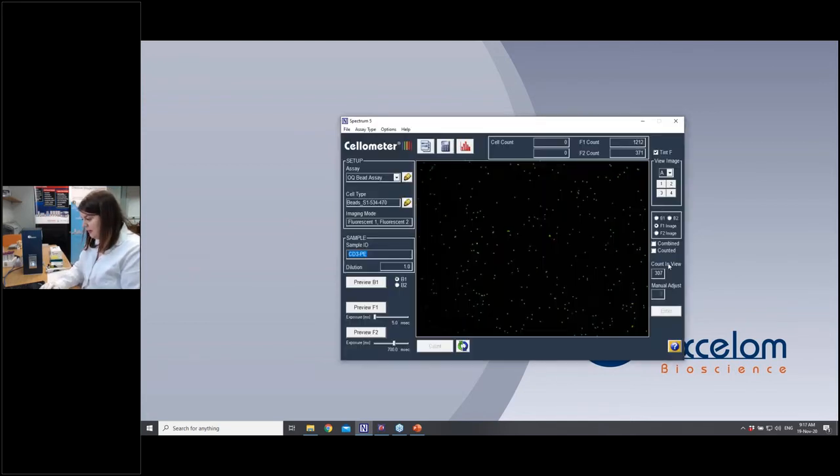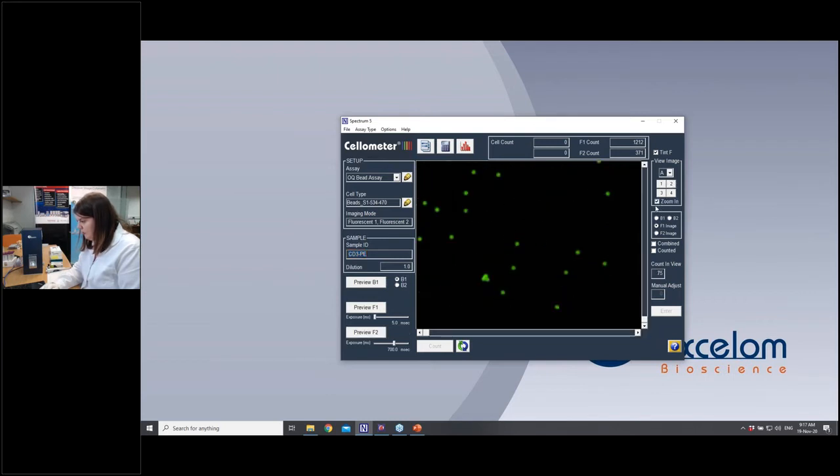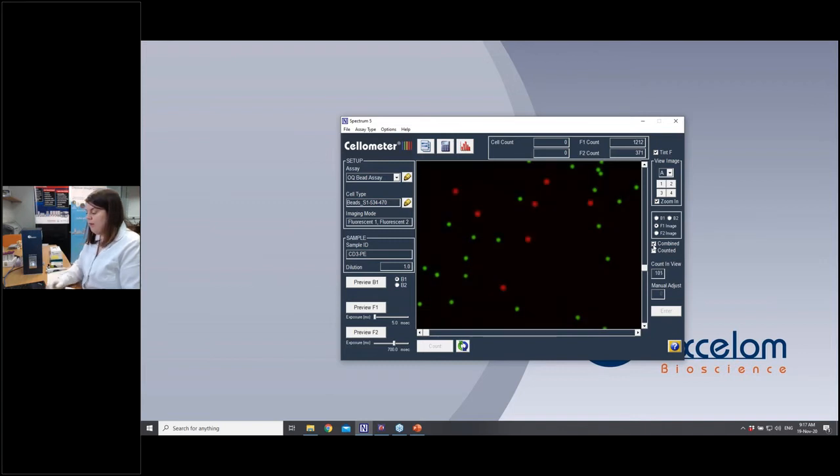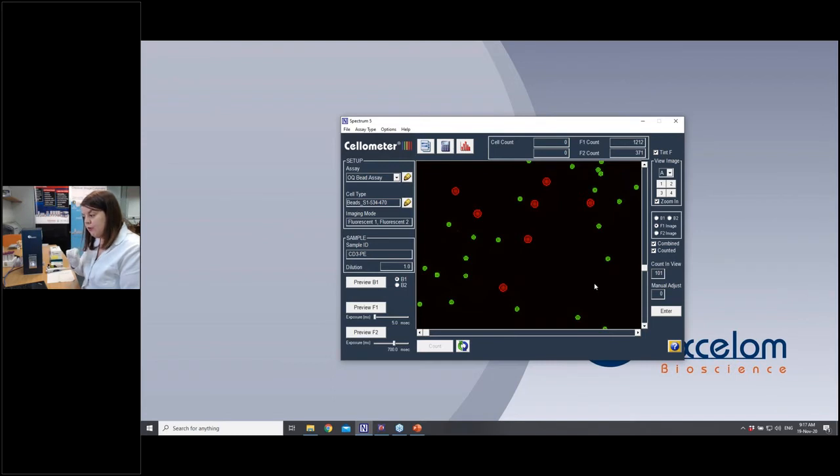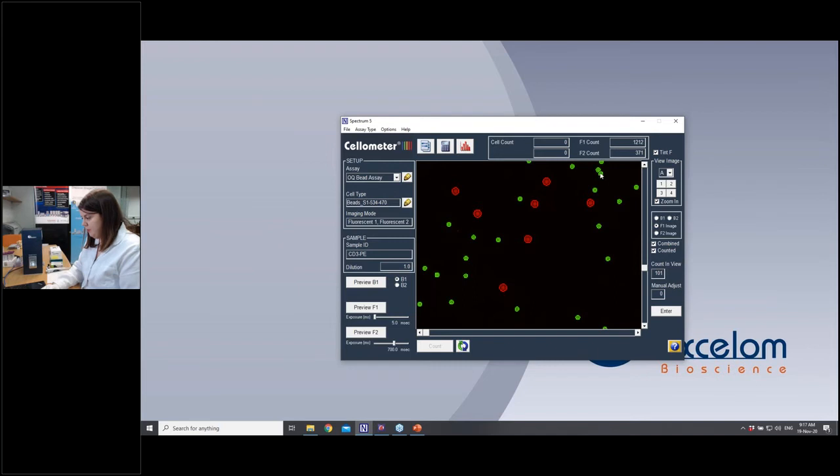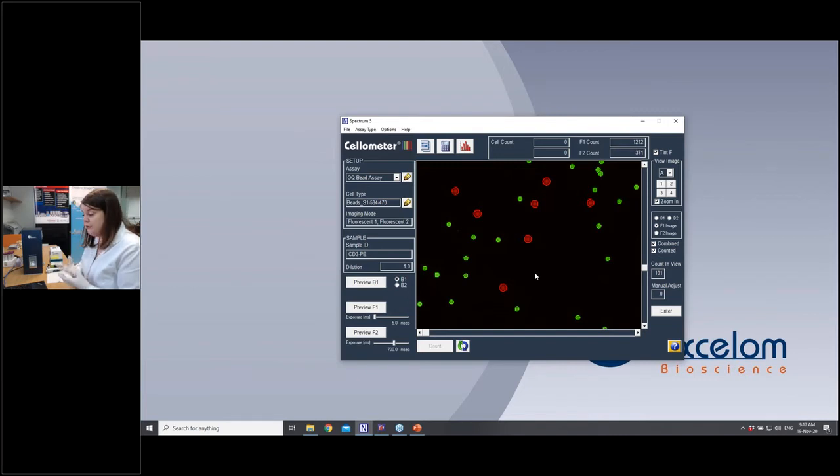So I can close that and it doesn't just spit out a number and expect you to agree with it. You can close that down. I'm going to zoom in a bit so we can see this a bit more clearly. We can look at those images and we can also move around so we can see them more clearly. We can also look at a combined image now of the red plus the green in a single sample as well. And we can turn on the counted mode, which will draw a little red circle around all of your red beads or red cells and a green circle around all your green beads or your green cells. Declustering is very good. We can see that we've got two close together here at the top and it declusters them very well. And we can see here that the red beads are definitely larger than the green ones. So this is part of the process. You should be looking at images and you should be checking exactly what has been counted.